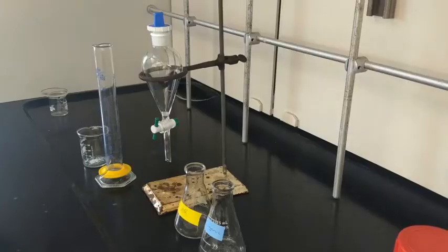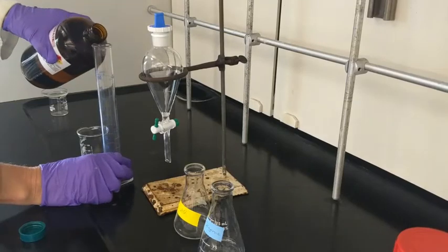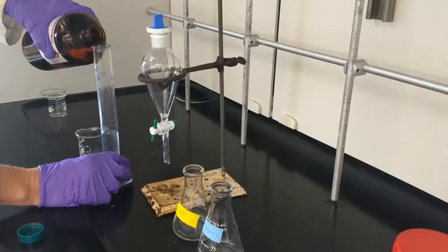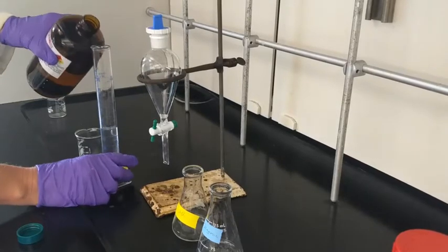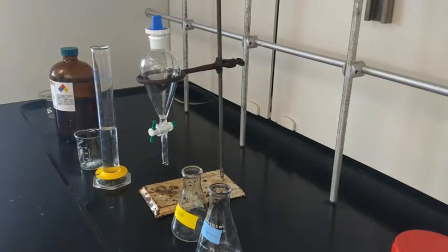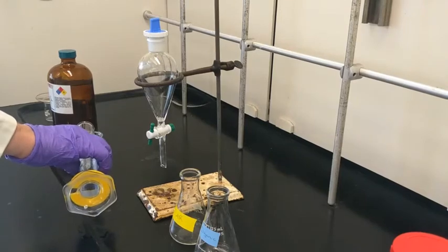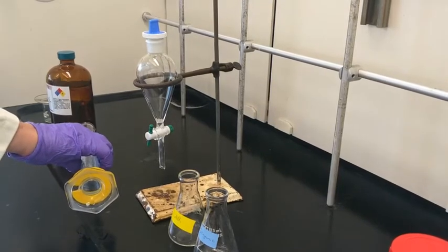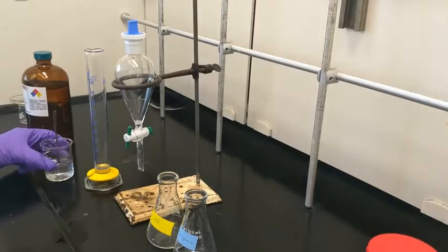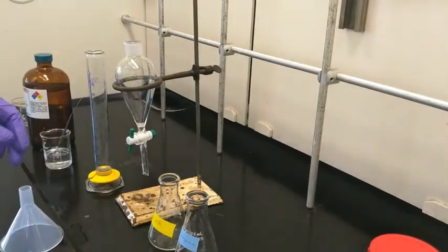Now you'll go back to your hood and set up your glassware — have everything labeled. In this technique we'll go through a bunch of glassware, so you want to have everything prepared with your solvents in labeled glassware. You won't have the bottles in your hood; you're going to go to the reagent hood, fill your containers, and come back. In this step I'm dissolving the sample, adding the solvent, giving it a swirl to let everything dissolve, and then adding it to the sep funnel.